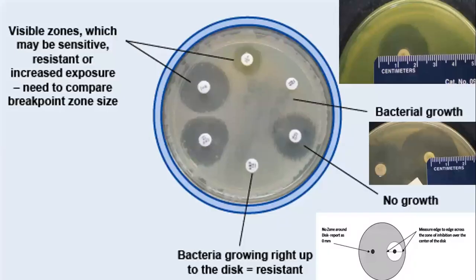This just shows how to measure the antibiotic zone. Use the scale, from the disc circumference to circumference, and let the scale pass through the diameter of the disc. Whenever you have two zones fused, or the disc is placed very close to the rim, better measure the radius and multiply by 2.